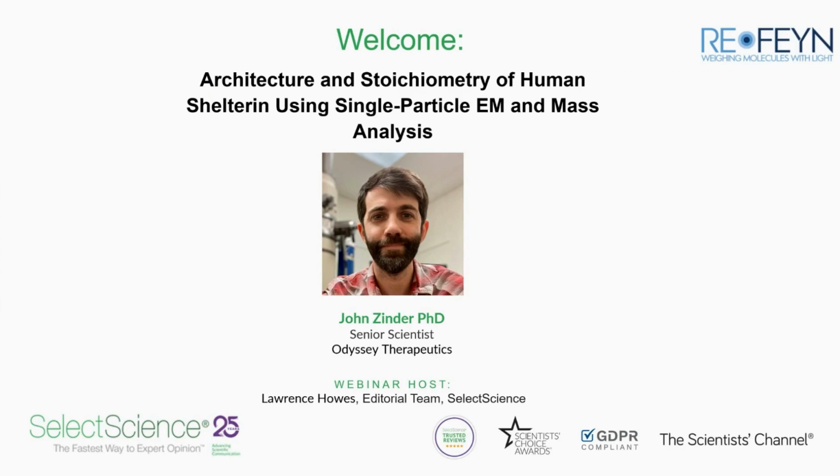This webinar will discuss the purification of Shelterin subcomplexes and reconstitution of the entire complex using full-length recombinant subunits.